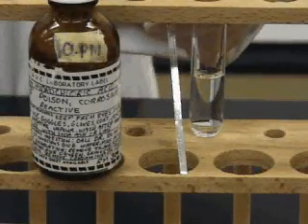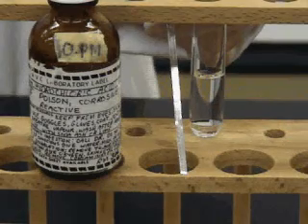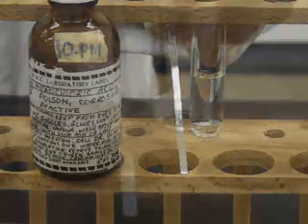Record your initial observations for the magnesium strip and hydrochloric acid solution.